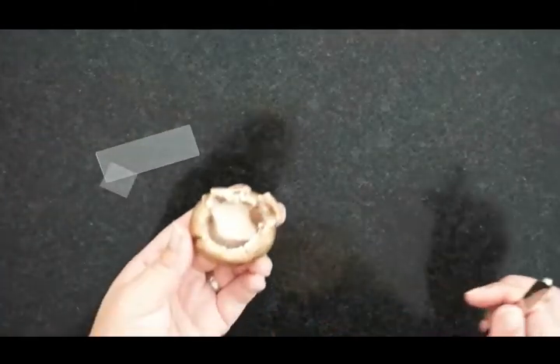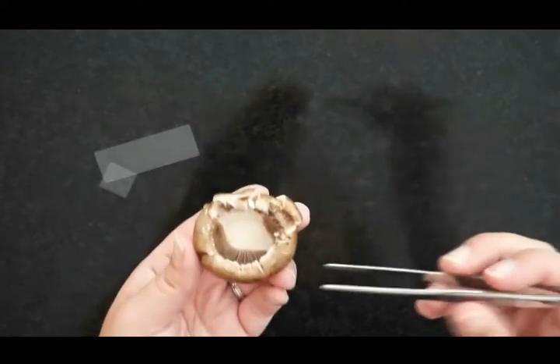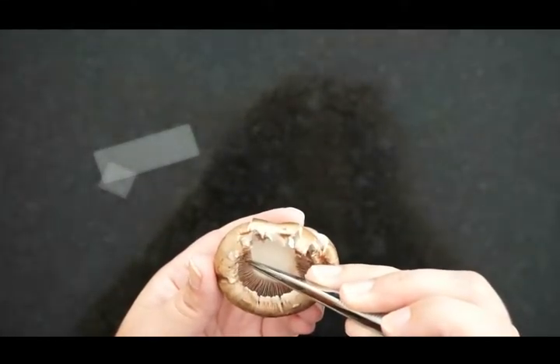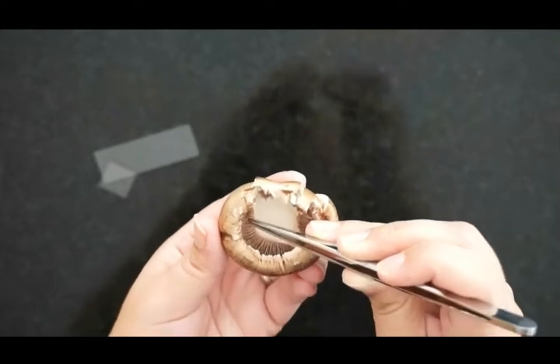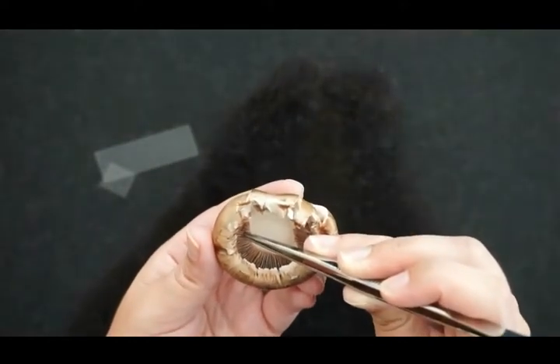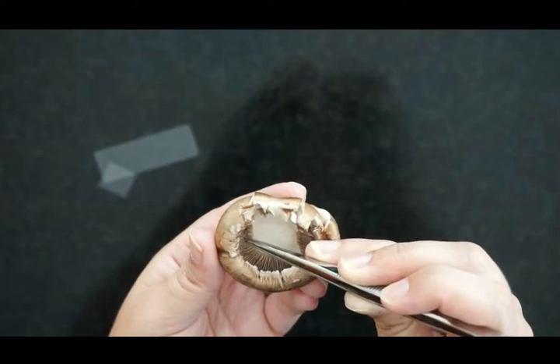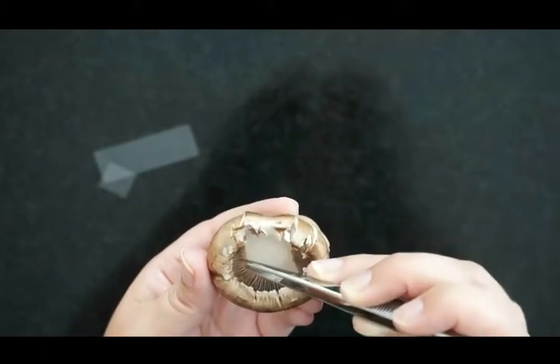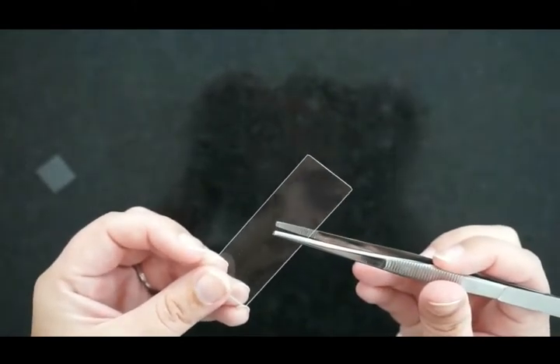Then in the next part of the lab, you'll take your glass slide and your tweezers or forceps, and very gently pull out the largest piece of gill that you possibly can. It's hard to get a whole gill, but see if you can gently get most of one. Then put that on your glass slide.